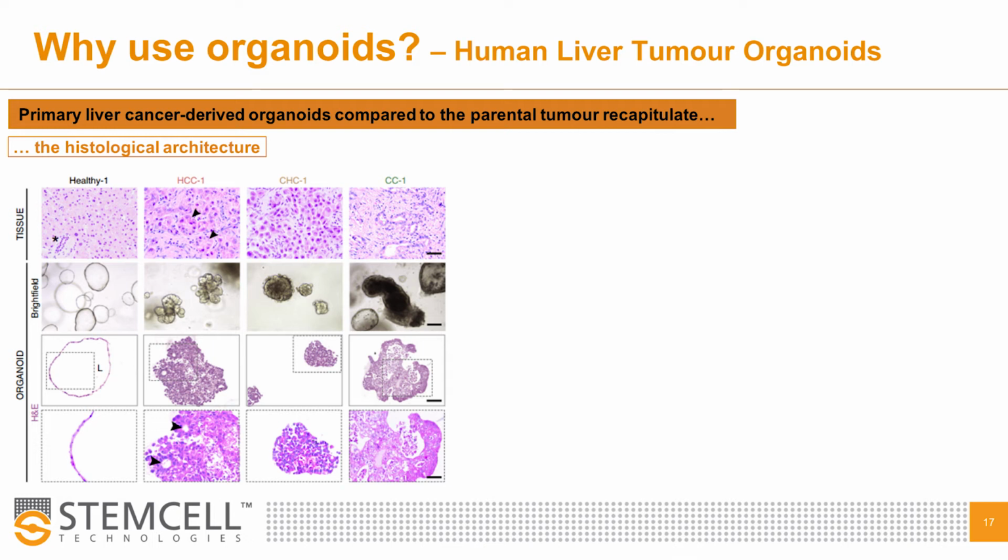To study these different tumor subtypes, the authors used H&E staining of healthy and tumorigenic resected liver tissue, and in parallel established organoids from these tissues. While healthy-derived liver organoids grew with a single-layer epithelium surrounding a central lumen, as seen on the left, tumor-derived organoids formed compacted structures that resembled the corresponding tumor of origin.